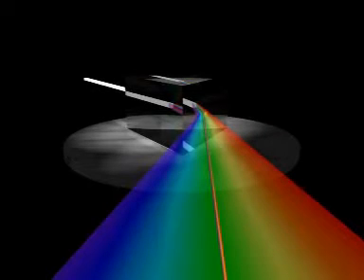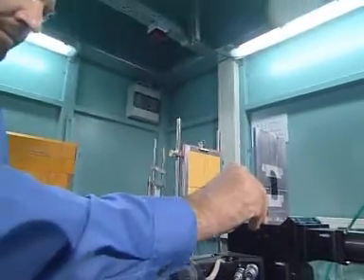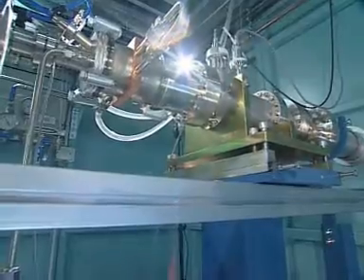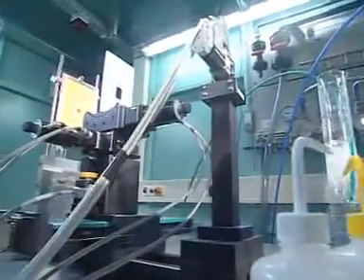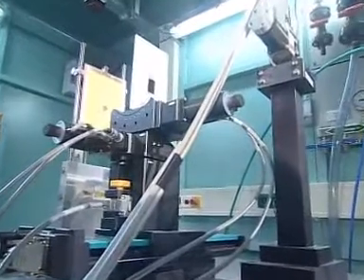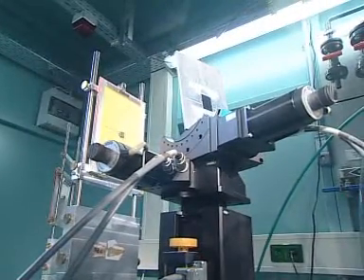Synchrotron radiation is characterized by its broad spectrum of wavelengths of high intensity. This broad spectrum excites a particularly large number of diffraction reflections, which constitute a symmetrical pattern, the Laue pattern. This diffraction pattern is varied by turning the crystal on the goniometer.